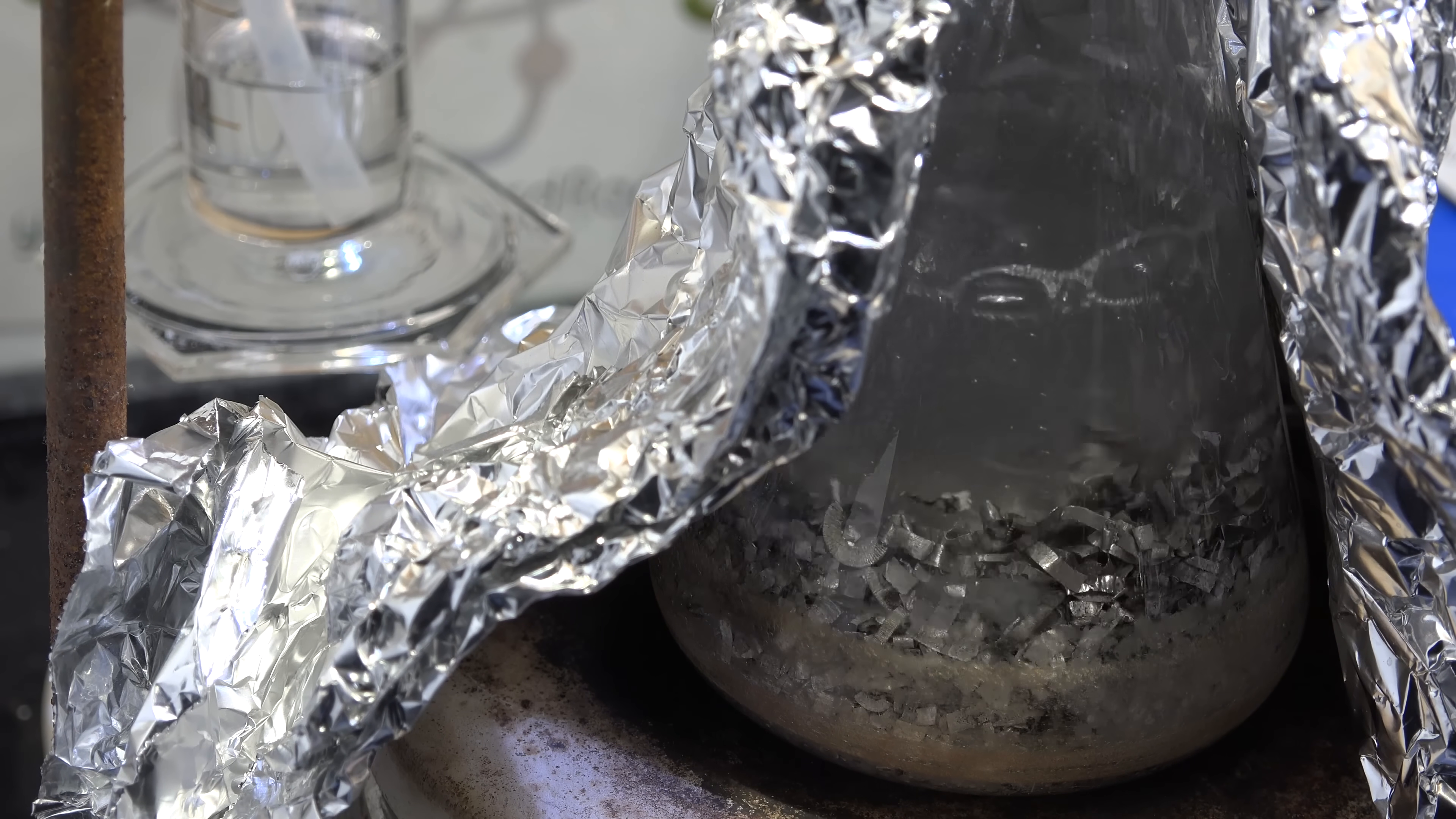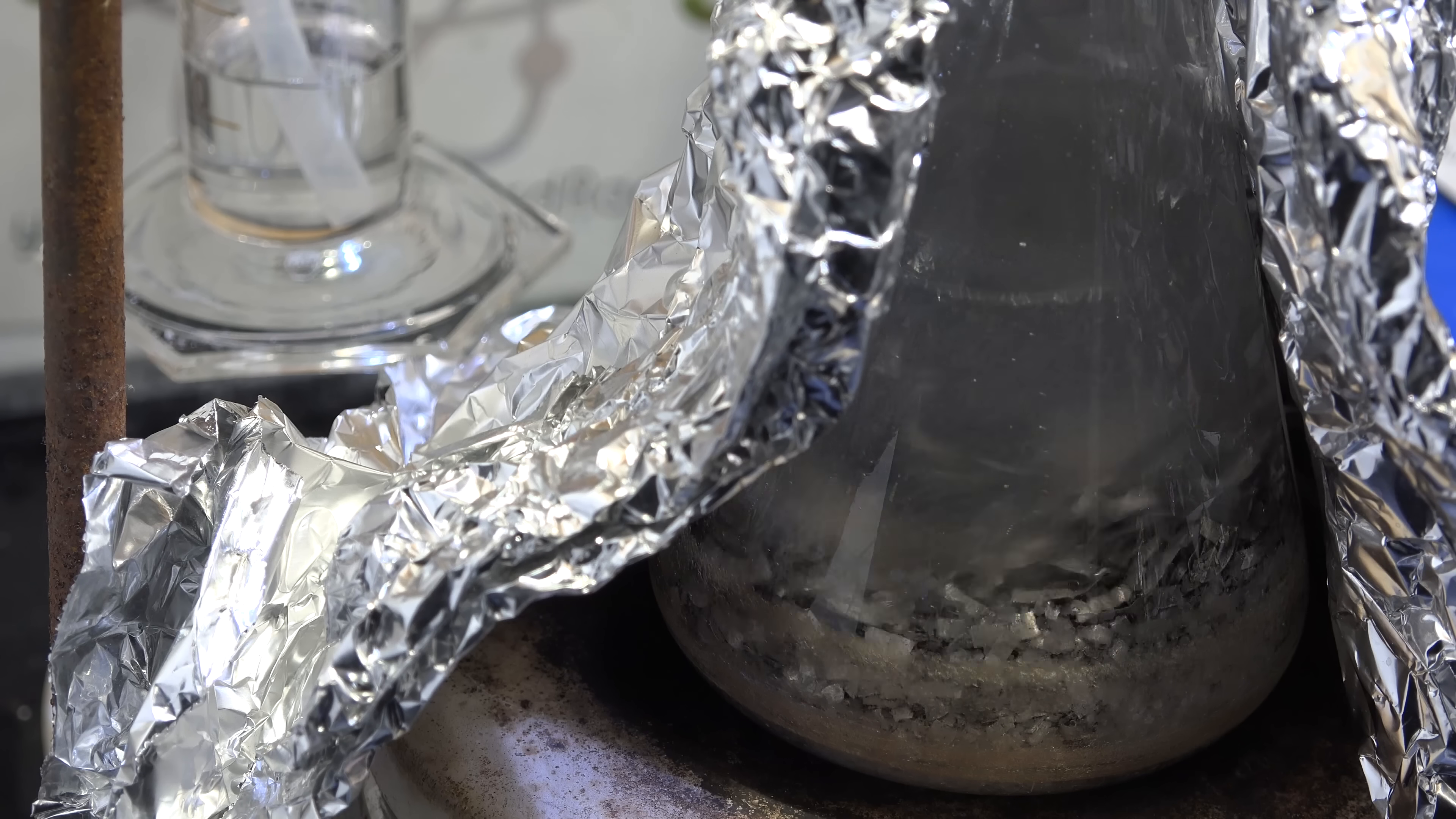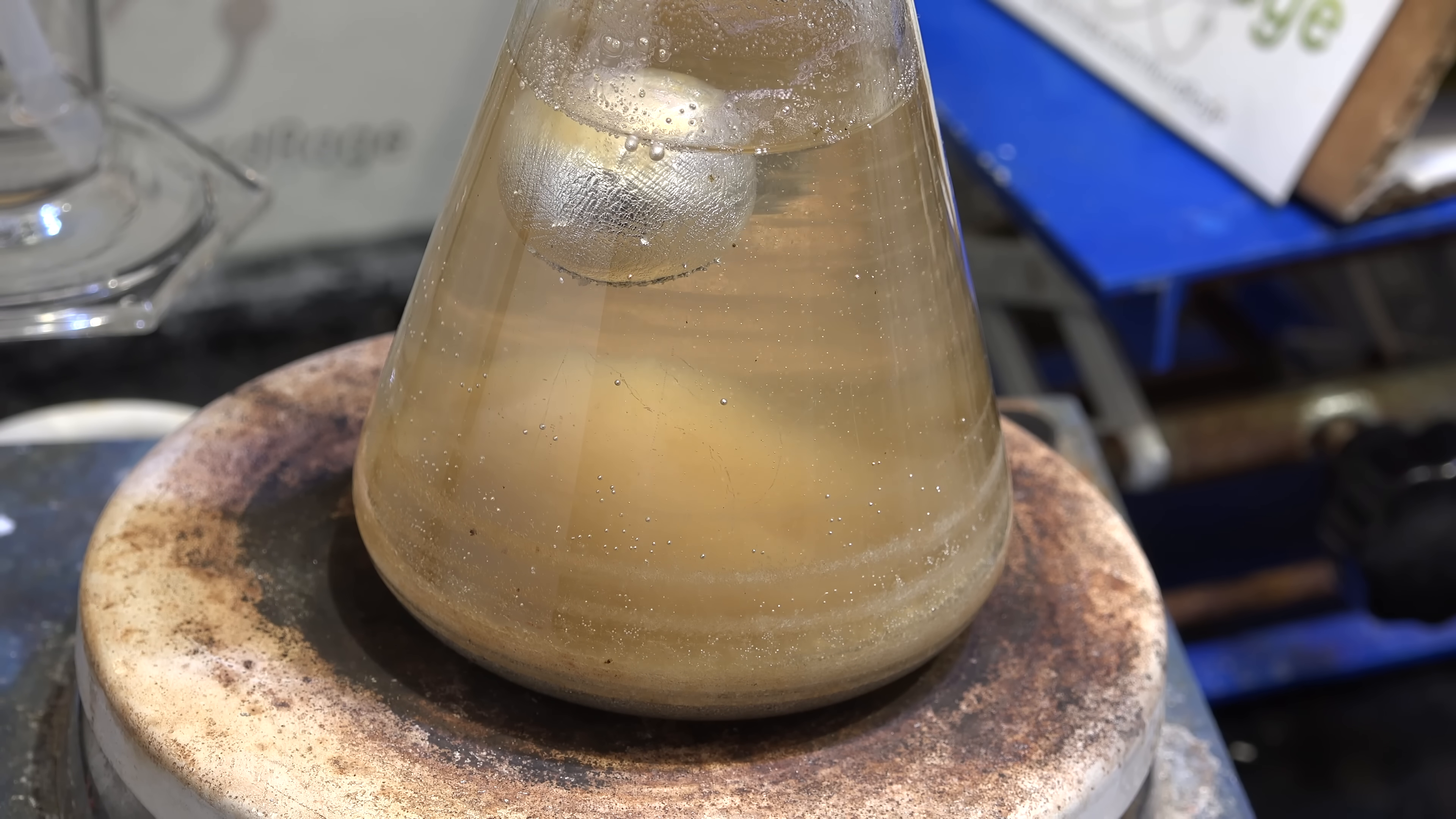I've been trying to make sodium metal by the alcohol catalyzed magnesium reduction approach and thus far I've been rather successful. Turns out that all you need to do is mix together magnesium metal, sodium hydroxide, a percent of tertiary alcohol and use baby oil as the solvent. Then you heat the mixture on a hot plate up past 200 celsius, preferably 340 celsius and stir. After three days you get sodium metal. Of course there is a lot of processing with dioxane to separate it from the slag but for the most part the process does work.